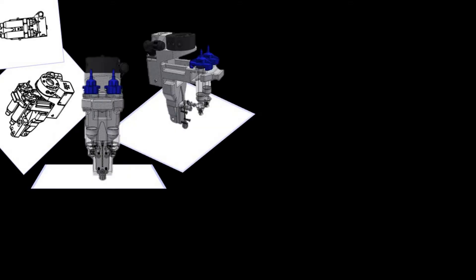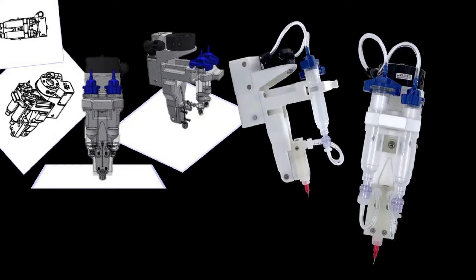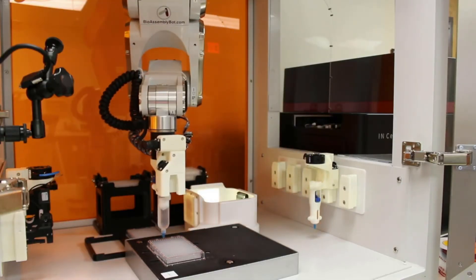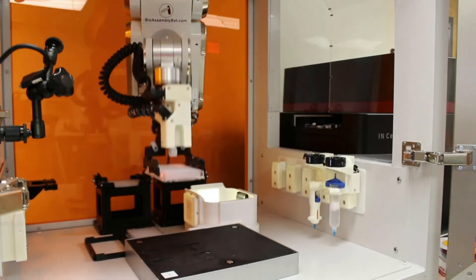With an open hardware and software platform, BAB works well with others, enabling a powerful and scalable plug-and-play agile bioassembly work cell.